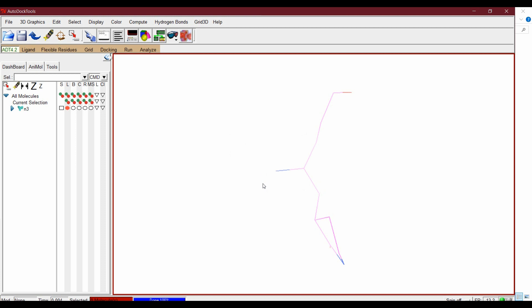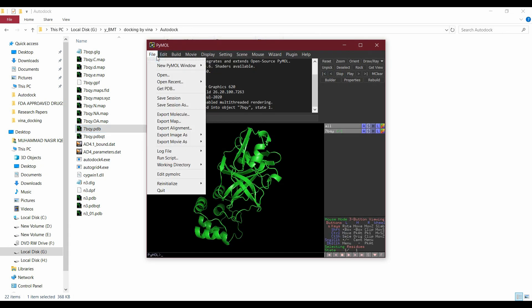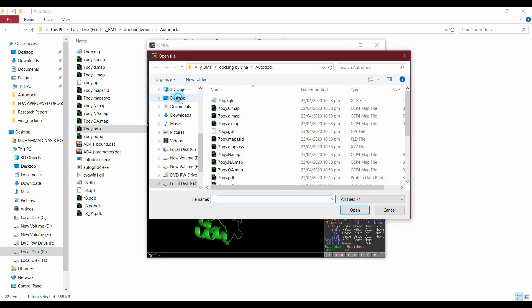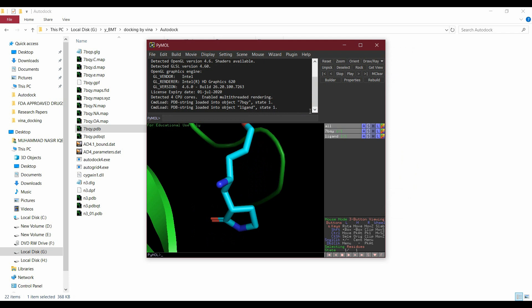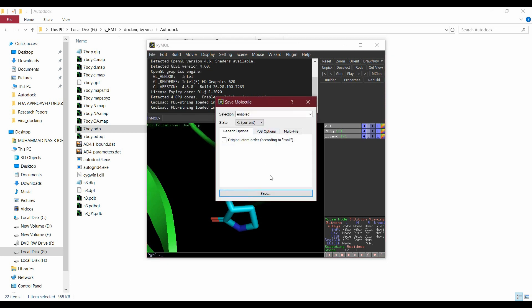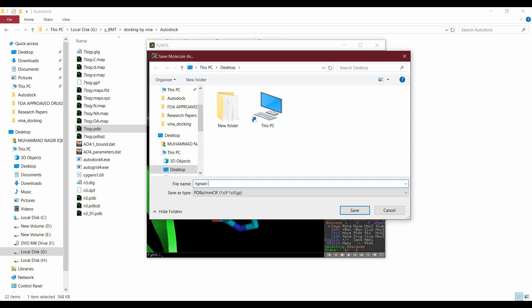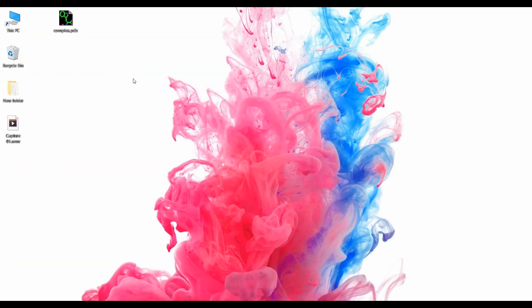Close this, then open the protein file from File > Open, and also open the ligand file. There is our ligand. Now we will save the ligand and protein complex file — go to Export Molecule > Save, and save it as ligand-protein complex .pdb. We now have our ligand and protein complex file.